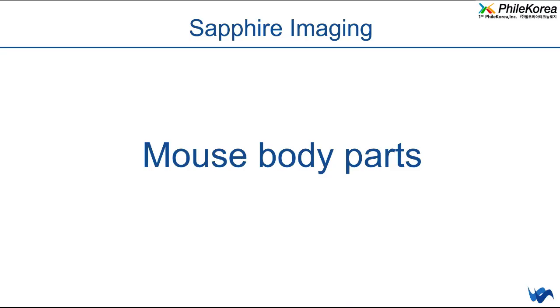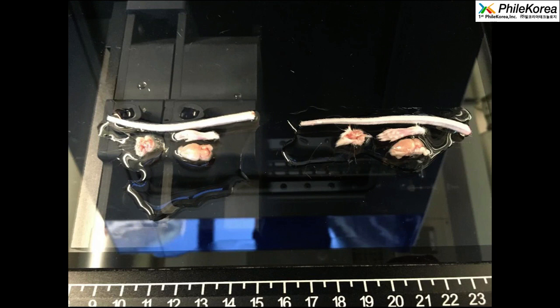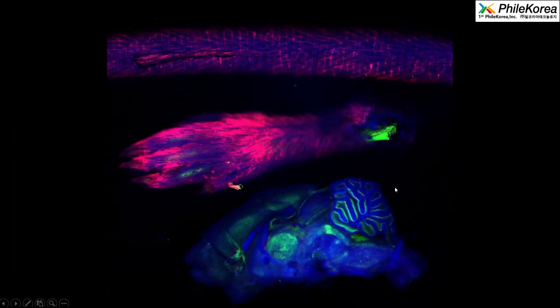And we also had clients who put different body parts on the glass surface, to see if there is any GFP expression in any body parts of the mouse. And here's the result. It's in black and white. We can also show you this in color. And when we zoom in, here's the mouse brain. And here you can even see the bone, right?